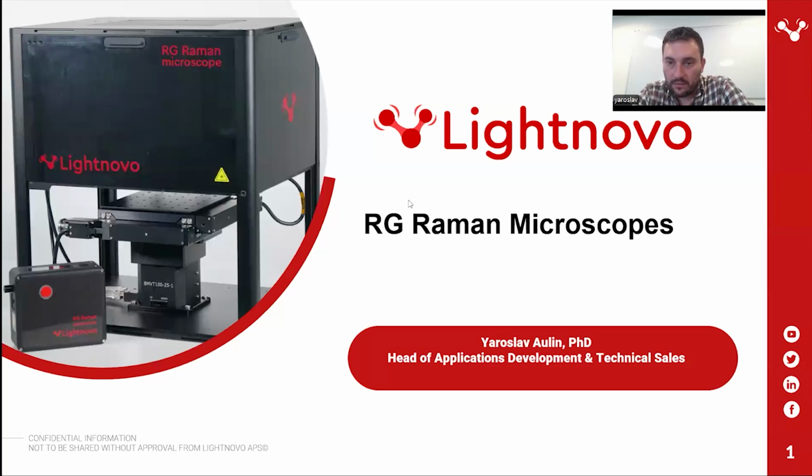Okay, I see the first question: with 785 nanometer as excitation, what laser power on the sample? As I mentioned during the talk, I'll repeat it again: it depends on the spectrometer, and power on the sample can be up to approximately 100 milliwatts for 785 nanometers.